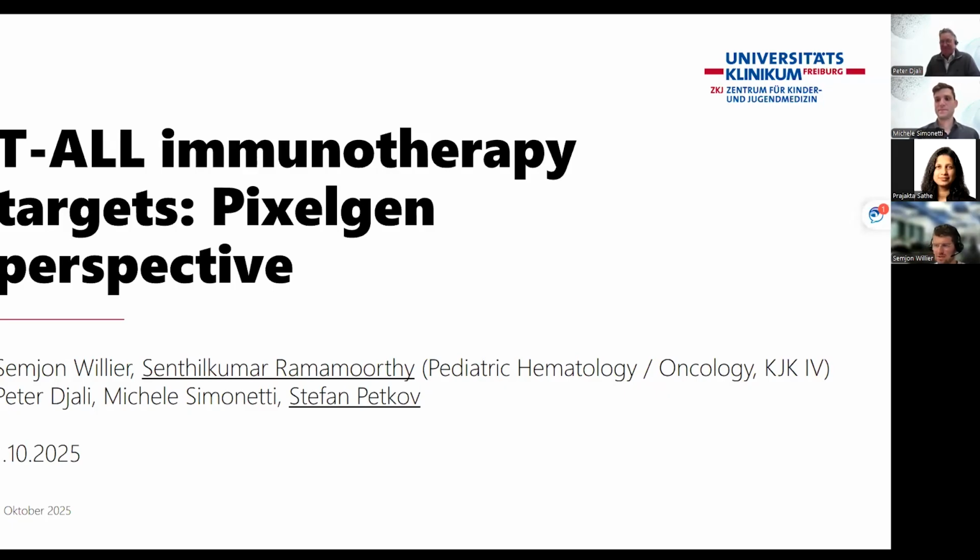So it's a pleasure to give you a short perspective from our experience with Pixelgen. As a kind of introduction, I met Pete at the meeting in Munich this year in February, and I was very intrigued by this nice data that Michele just showed on B cell malignancies, and I thought, well, what could be done for B cells, why couldn't it be done for T cells? So this is why I'm going to talk to you for just a few minutes and give you some snapshots about what we have been doing, in particular looking at T cell malignancies and how we can get our fingers into the differences between physiologic and malignant T cells.